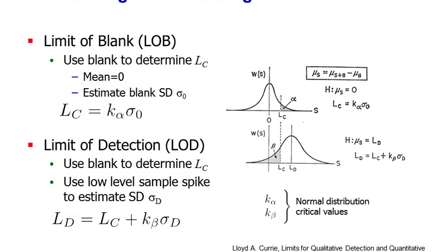So if you assume that you're measuring the blank, let's say, so you know there is no analyte for sure, and you're trying to measure your analyte, you are going to get some signal, which is usually noise. So you make repeated noise measurements, and you assume that your noise is distributed normally with mean 0, because this is the blank. Your actual measurement is 0. So you do that, and you also have a standard deviation for the distribution of your noise.